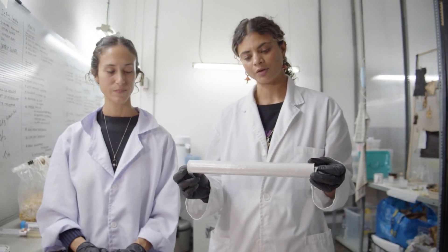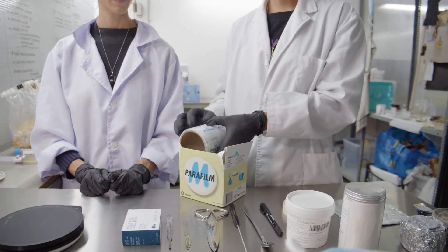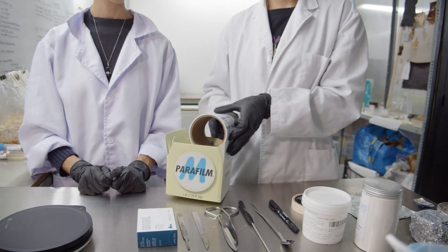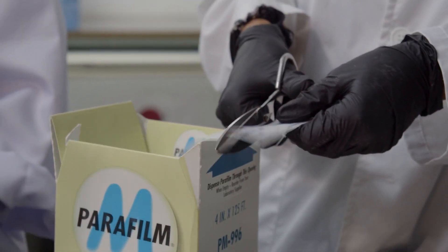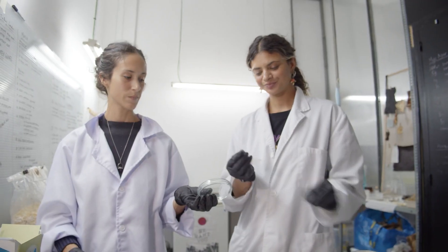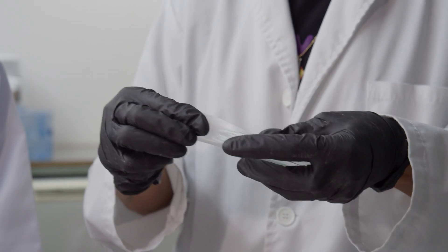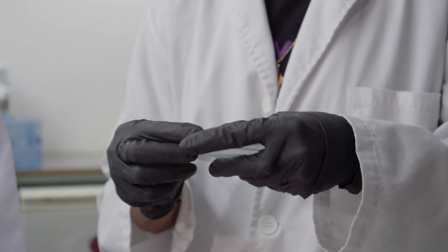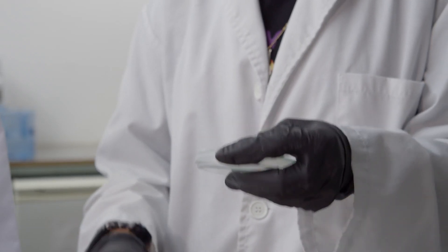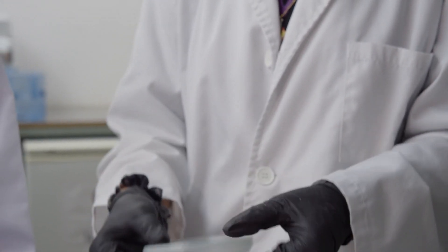Cling film or plastic wrap is used mainly when working with micro composites. Parafilm is a very special tape material we put around our petri dishes — it's like a stretchy, plasticky tape that allows the mycelium inside to breathe, but prevents other microorganisms from entering, helping prevent contamination once your plates are transferred.